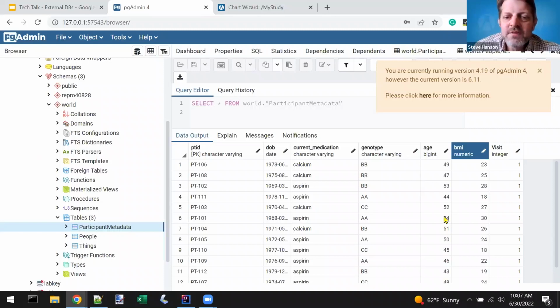Another question from a user here. Does the table get removed if the link is dead or offline? And if I understand your question right, do you mean if the connection between LabKey and the external database is severed or dies somehow, does the table get removed? I don't know. Actually, Matt, do you know offhand? I mean, we could just try it too.